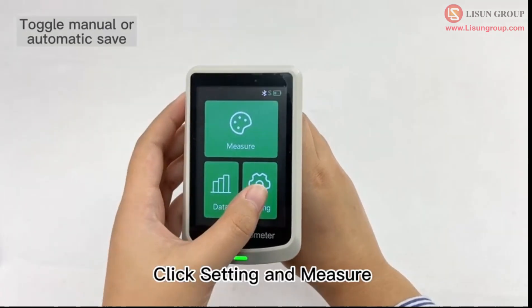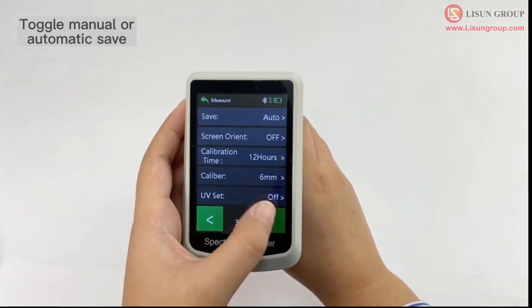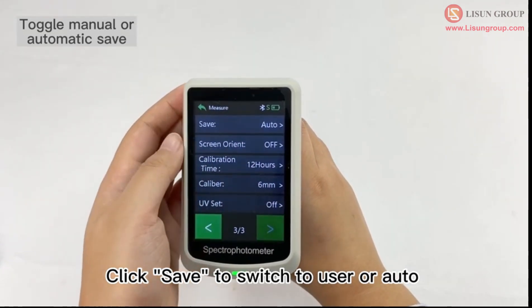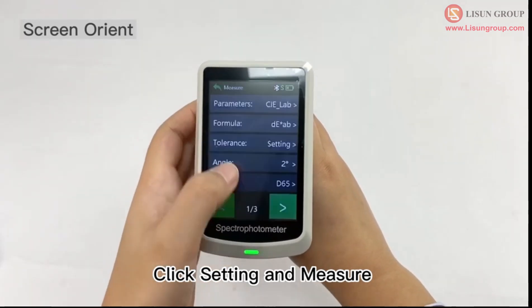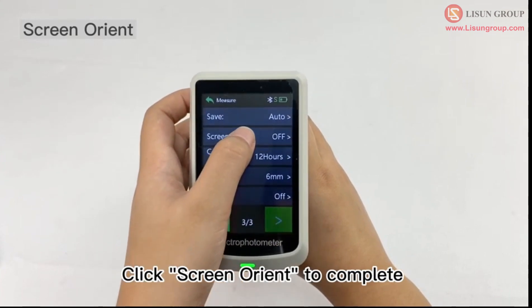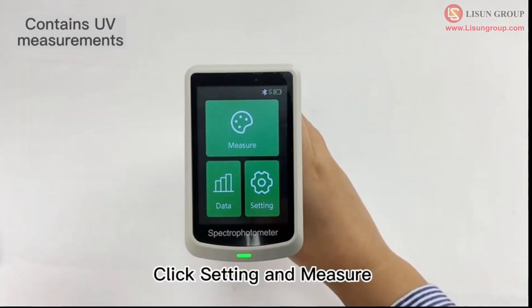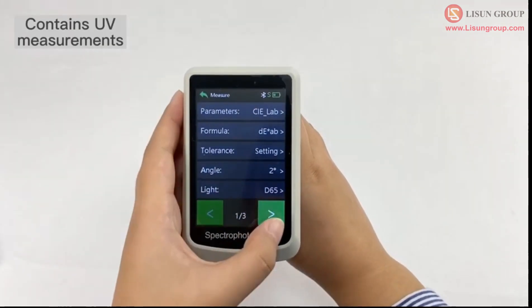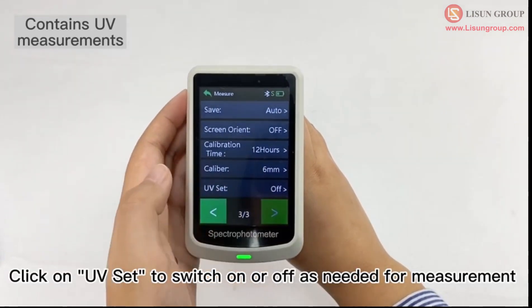Click setting and measure, then click save to switch to user or auto mode. Click setting and measure, then click screen orient to complete orientation setup. Click setting and measure, then click on UV set to switch UV on or off as needed for measurement.